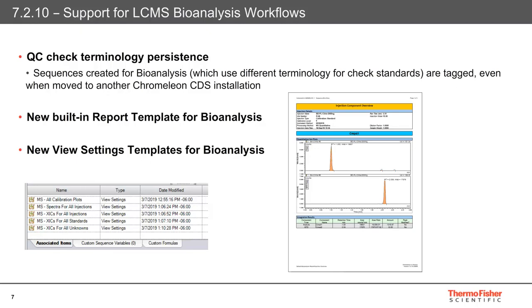We also have new view settings templates designed for handling large datasets. The templates have been added to the contributed content folder of the Chameleon distributable, and can be imported or added to any relevant MS sequence. These view settings include examples for layouts such as a component across all QC samples or unknowns, and MS spectra of a component across all injections. Both the report and view settings templates are designed to get users up and running quicker, saving valuable time. The QC terminology check provides confidence and consistency by highlighting any change with a visual message bar, which displays whether the stored sequence setting is different from the current settings defined in the Chameleon administration console.